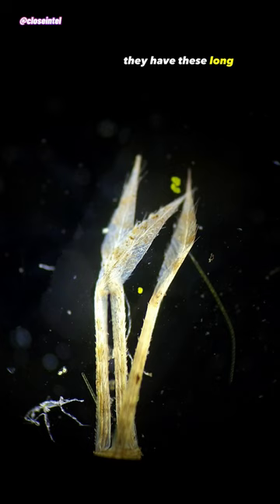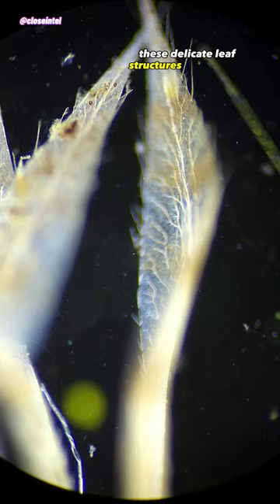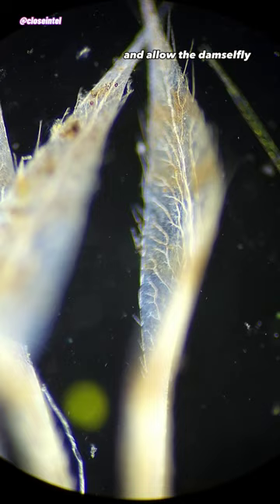They have these long tail-like structures with three leaf shapes that are in a tripod configuration at the tip of the abdomen. These delicate leaf structures are actually their gills and allow the damselfly to obtain oxygen from the water.